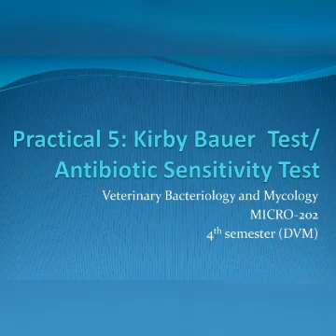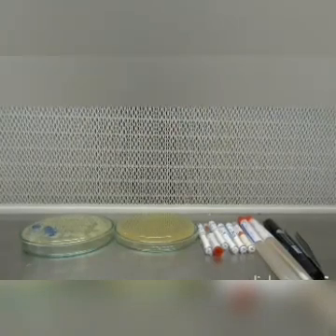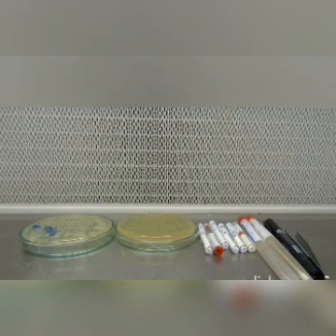Today we are going to perform the Kirby-Bauer antibiotic sensitivity test to determine the sensitivity or resistance of various pathogenic bacteria to various antimicrobial compounds, in order to diagnose and select treatment options for patients. The pathogenic organism is grown on Mueller-Hinton agar in the presence of various antimicrobial-impregnated filter paper discs.